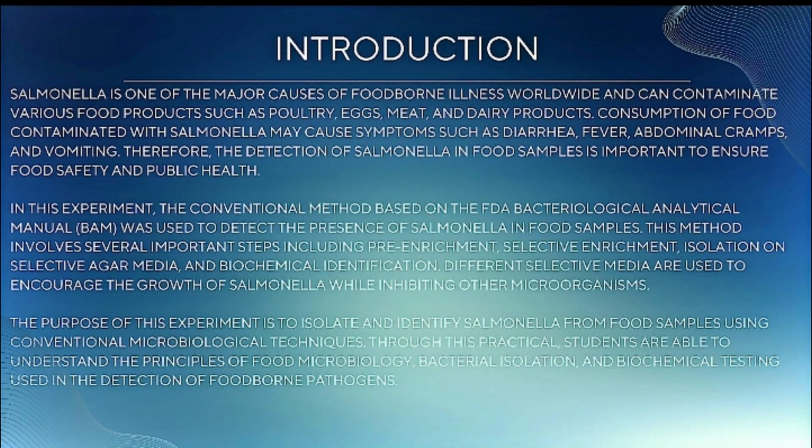As we know, Salmonella is one of the major causes of foodborne disease illness worldwide and can contaminate various food products such as poultry, eggs, meat, and dairy products. Consumption of food contaminated with Salmonella may cause symptoms such as diarrhea, fever, abdominal cramps, and vomiting. Therefore, the detection of Salmonella in food samples is important to ensure food safety and public health.